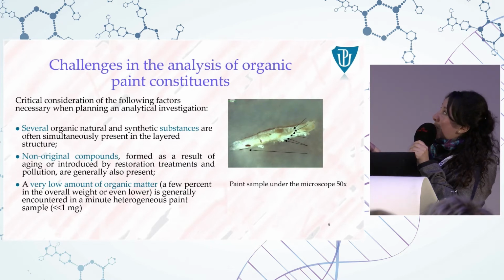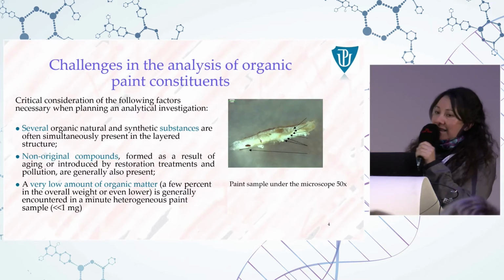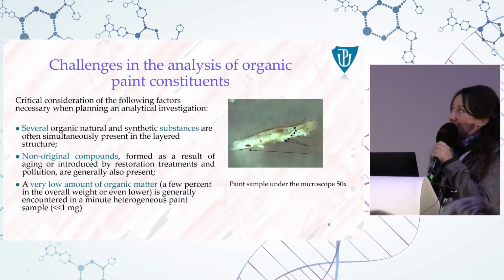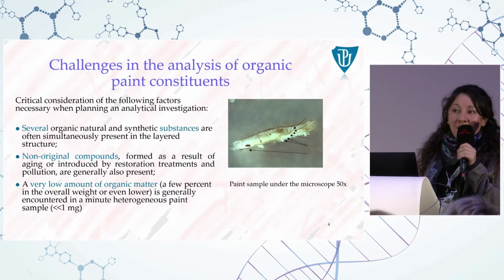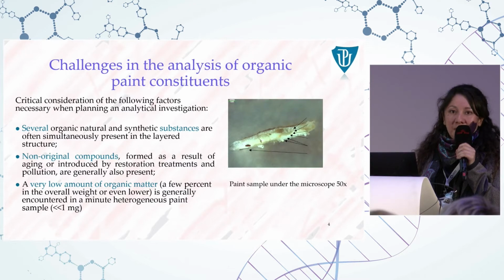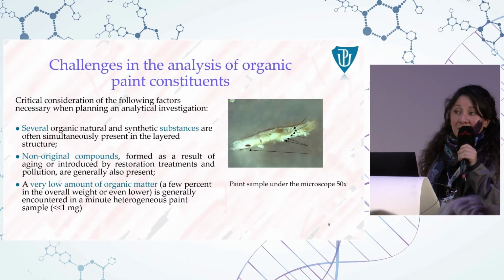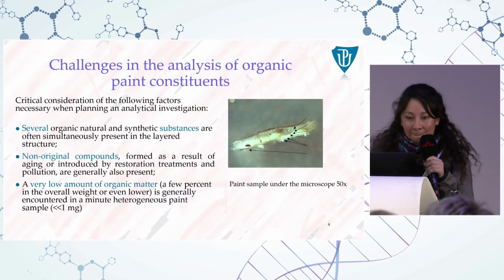Some of them had migrated, and we have also some mineral matrices. So when we start an analysis of this type of sample, we really need to be sure that we have a very consistent, efficient method for analysis. And also, we have limited sample. We cannot make any mistake.